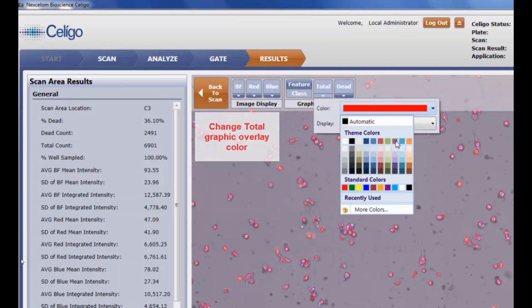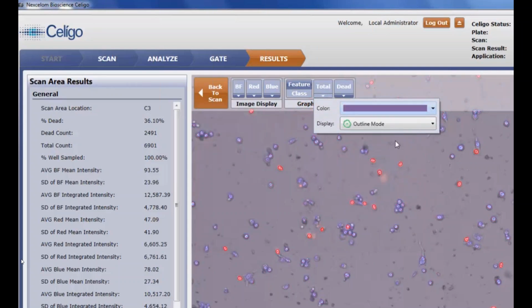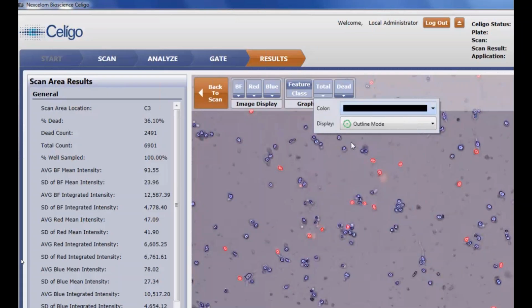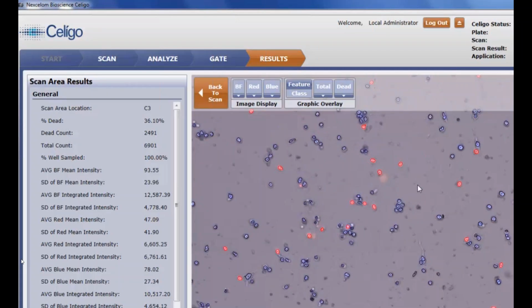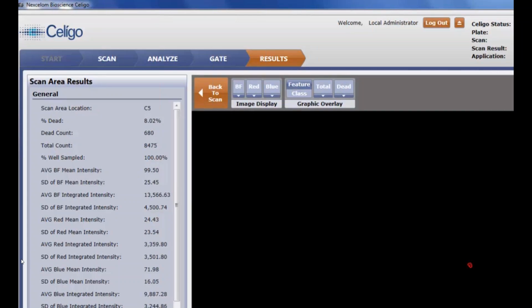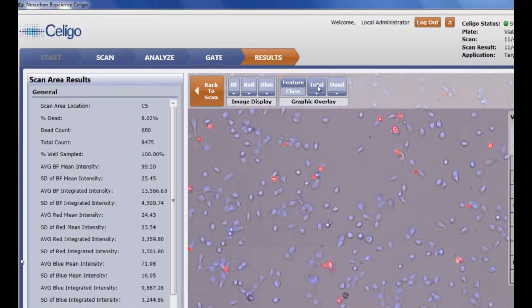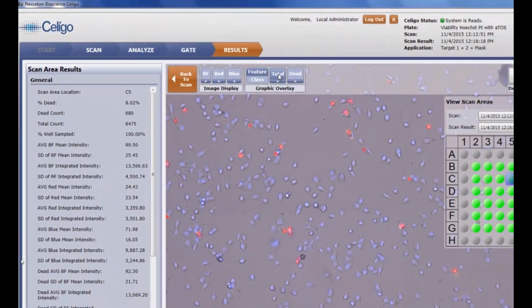If you are interested in knowing how to do morphology analysis on your bright field cells, just raise your hand or note it when we come to the end of this webinar, and I'll try to create another webinar on how to do morphology analysis on your bright field adherent cells. For stuff like this, you can clearly see the cells are not happy. They're rounded up, but they're not dead. They're probably fine, but they're actually probably going to die in a minute.